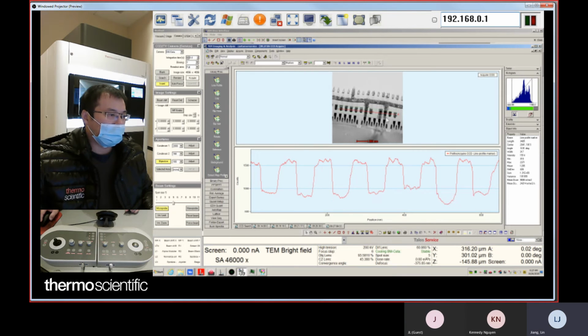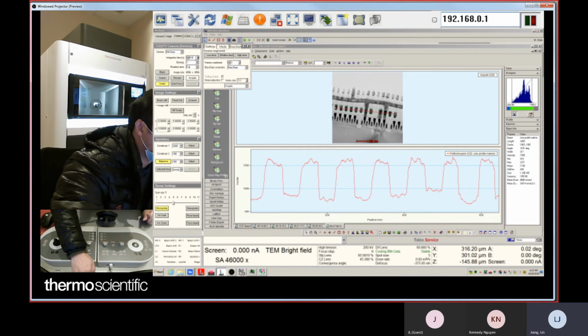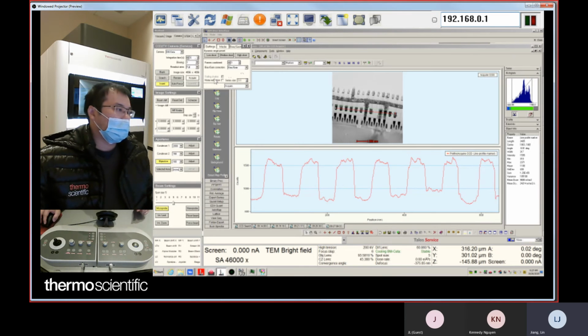Oh, because we did the binning, right? Okay, so this is 0.4. Right now we got 16. So that means we can go 0.5. If we go 1 second, acquire.